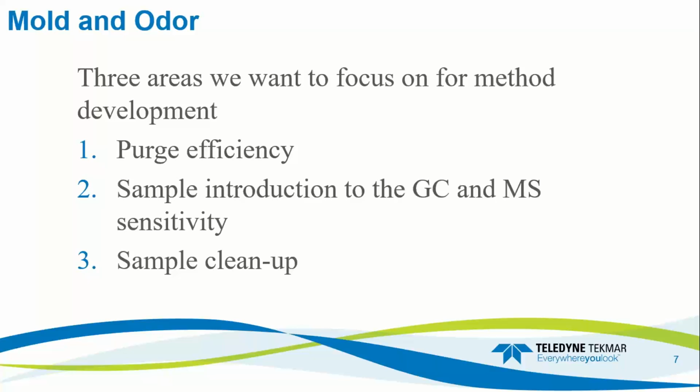They don't pose a human health risk that we know of, but humans have an extremely low odor threshold for these compounds. So we're talking in the PPT range, which means when you smell that musty, moldy, just-rained smell in your water, you assume that the water isn't safe and you don't want to drink it. Since we can smell in the PPT range, we need really low detection, which further complicates the fact that these compounds are poor purgers, and that creates challenges when setting up these applications.